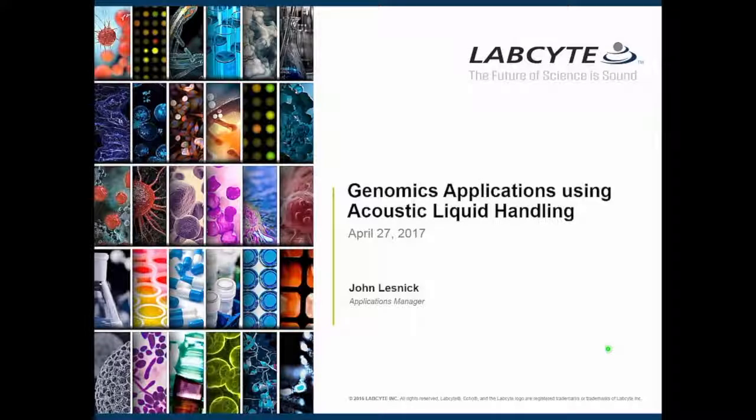Thank you, Dr. Carney, and thank you all for taking the time to join the webinar. We only have an hour, and I want to be sure there is time for discussion, so I want to get started and jump right in to describe some genomic applications using acoustic liquid handling.